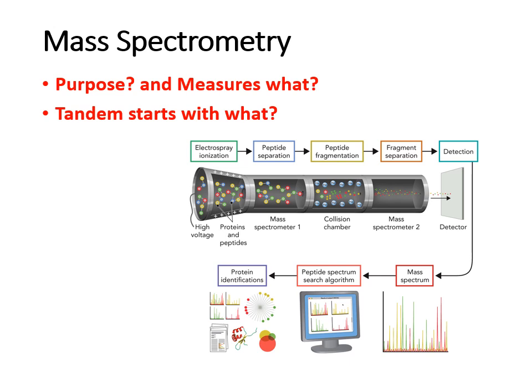And there's also a version of it called tandem mass spectrometry. And for that one, that's what you see here. The very first step is electrospray ionization. With tandem mass spec, you're basically using it to predict the amino acid composition of trypsin or tryptic fragments. And basically, you put those fragments into the mass spec with them going through the electrospray ionization first.